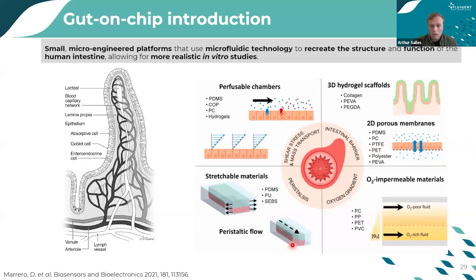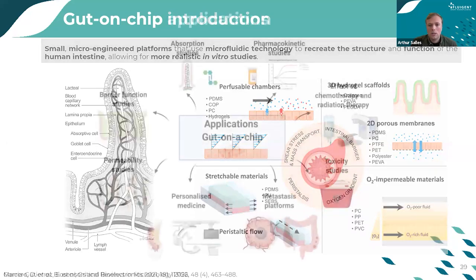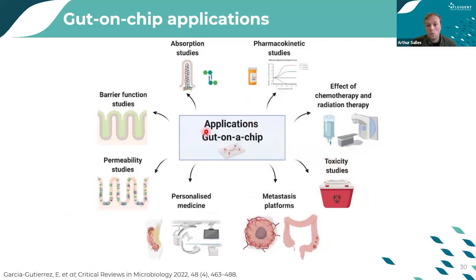And yeah, so what we wanted to do is also to understand all the different applications. So here it is. It's a wide range of applications, from the physiology of the barrier and absorption studies and permeabilities. And you will also have the drug discovery part with the pharmacokinetic studies, the effect of chemotherapies and toxicity studies, and the whole part of personalized medicine, with also the creation of organoids from metastasis on a gut-on-chip.